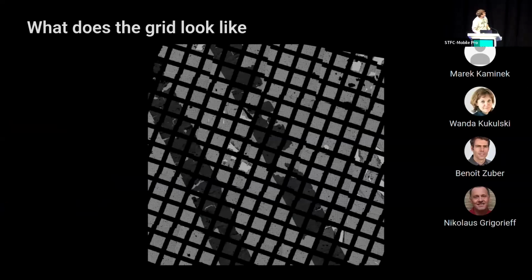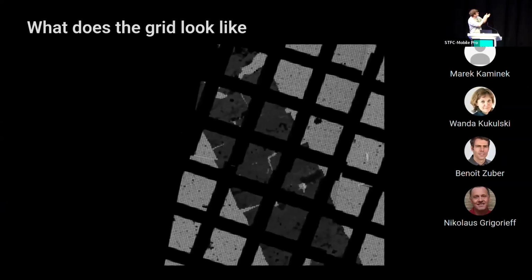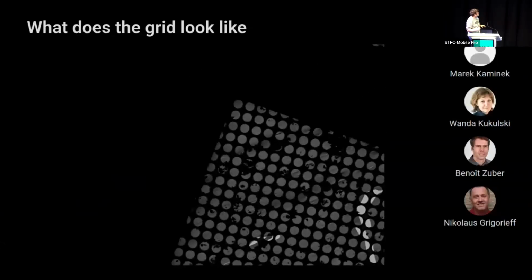So if we again zoom in a little bit, you can see that in this case the slices were laid over a very standard holey carbon. I think it was coated with platinum, but that doesn't really matter. Now in all of these holes, you see they're all covered with a thin slice that we can actually see through an image. What you might already notice is that there are these lines that go perpendicular to the ribbon. So they were parallel to the edge of the knife.